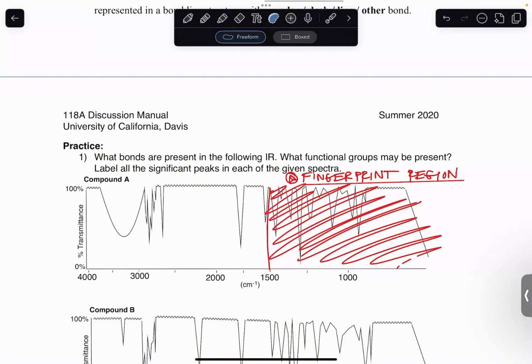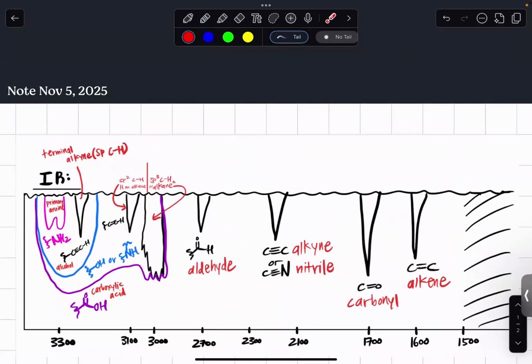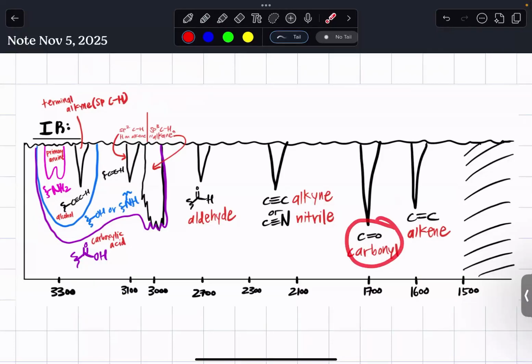Okay, so let's say this is 1500, right? And this is 2000. What's in between 1500 and 2000? Oh, I forgot. I know that's where it starts being double bonds. It's the C double bond O, because in between 1500 and 2000 is 1750, right? And then the closest to 1750 on here is going to be the C double bond O, the carbonyl, right?